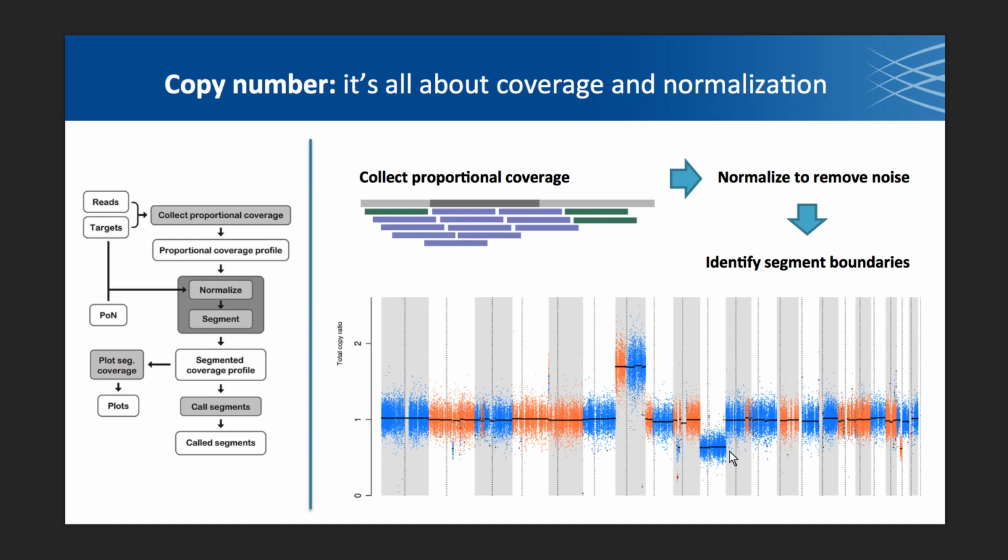These don't have to be pinned to integer numbers or even halves, because we're in the somatic sense. We might have subpopulations. We might have multiple copies of the chromosomes. We might have contamination and so on and so forth. So this is a pretty accessible example, but you will see copy numbers at a lot of different integers.